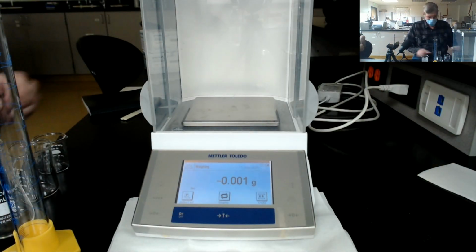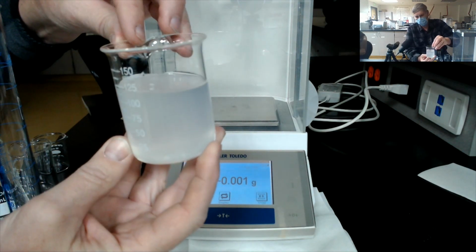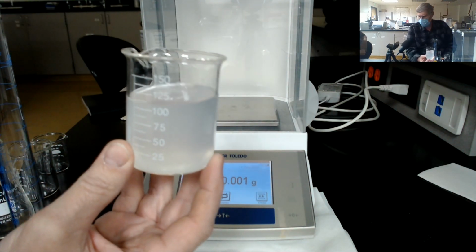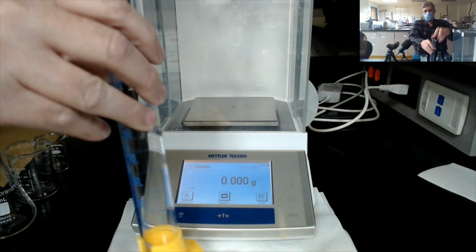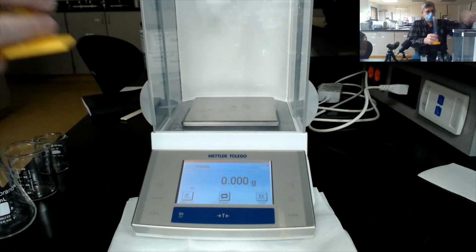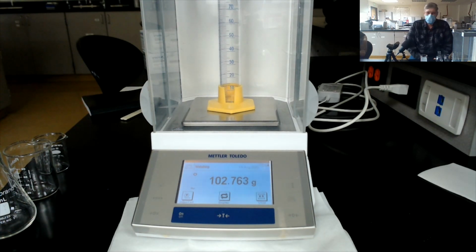All right, for part 3 and 4 of today's lab, we're going to take this mystery unknown liquid and determine its density. In this case, we measure the volume directly using our volume devices, and we measure the mass by difference. The first thing we must do for part 3 is to weigh an empty graduated cylinder on which we can measure volumes. Record this as the mass of the empty cylinder. Since we're using the empty cylinder for all 3 trials, you can record this one number for all 3 trials.